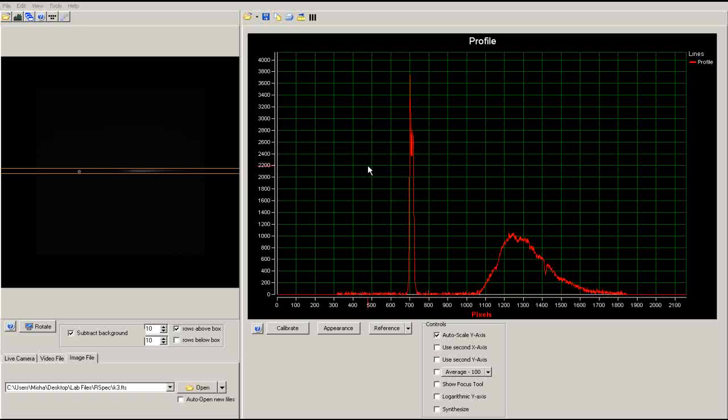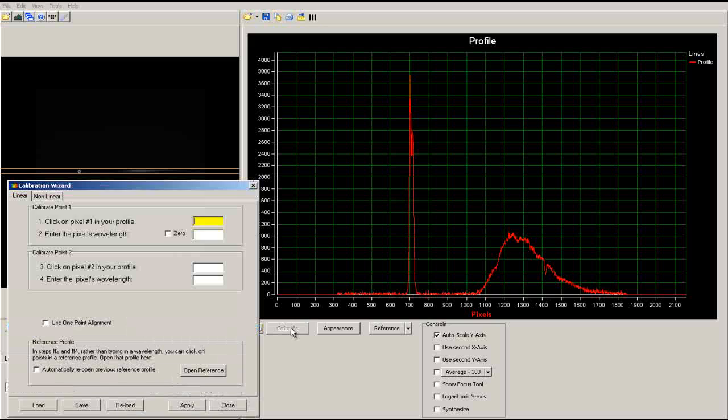To calibrate the spectrum, first click on the Calibrate button at the bottom of the spectra window. This will bring up the calibration menu.